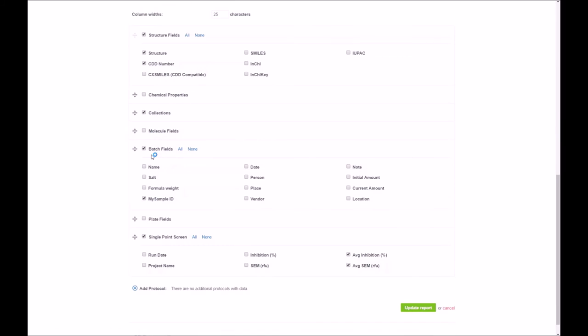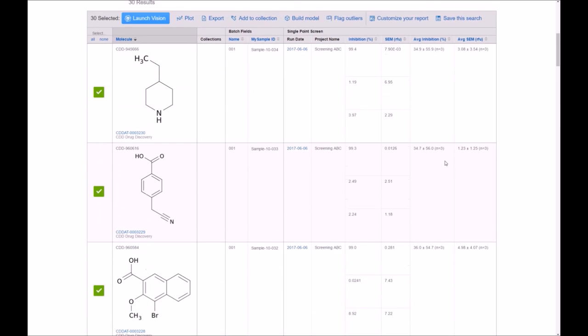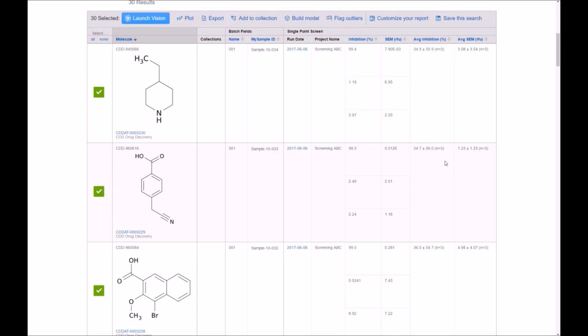I like to customize the report a little bit, show the different batch names, as well as the inhibition and SEM values of each one of the replicate data points. Once I hit update, you see that I now can visualize that information for the molecule, look at each one of the different data points available to me, as well as those averages. Thank you for viewing the video today.